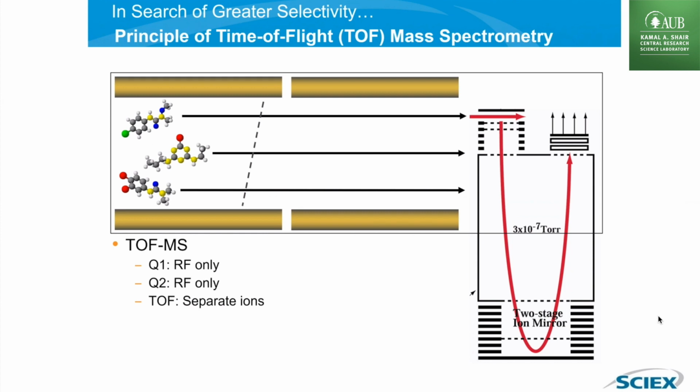You can make an MS scan, which is what we're going to talk about here, or you can make an MSMS scan. Talk about MSMS second. These are the 2 scans the instrument can do. The instrument cannot do anything else. In that sense, this instrument is a very simple mass spectrometer. There's only 2 kinds of scans you can do.